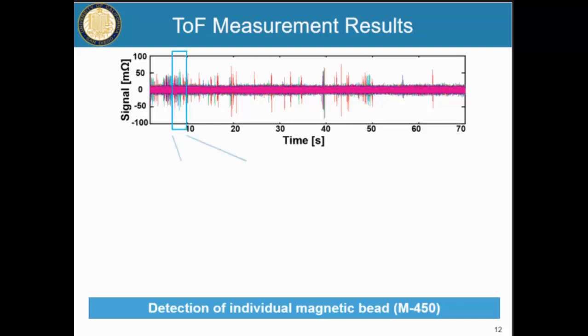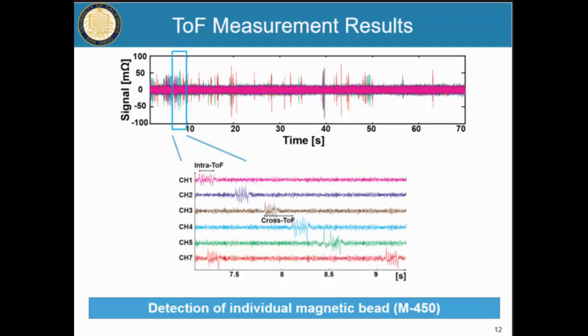What we're doing is we're overlaying 8 sensors on top of each other, and it's a little more informative when we shift these sensors up in amplitude so that we can clearly look at each sensor. Okay. And what we see is very interesting, actually. Once we detect an event on channel 1, it subsequently is detected on channel 2, 3, 4, and then onward down through our sensor array.